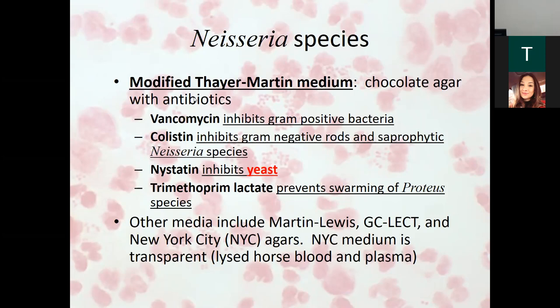But thinking of discs, we are using discs today. We'll tell the disc story down in the lab, but we were searching for the discs this morning, and we searched everywhere. We were in the fridge for I don't know how long, and we went in the closet, and we finally found what we were looking for, but in a different form. Then I just happened to open the freezer door, and there was what I'd been looking for all morning, our discs. So we've got some discs we're going to set up today, and I'll show you. You're definitely going to get to apply those and see how those work for strep. But this is all mixed into the Thayer-Martin, which we'll use next week with this lab.